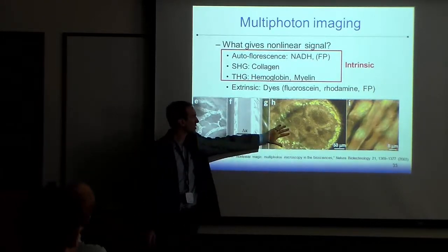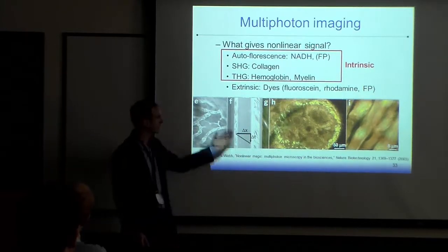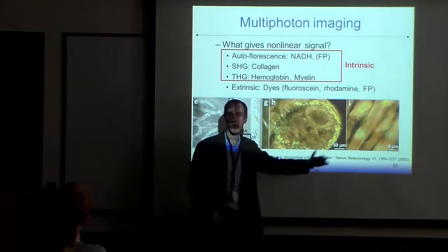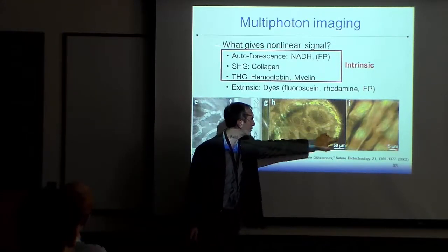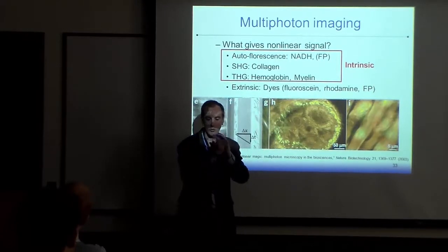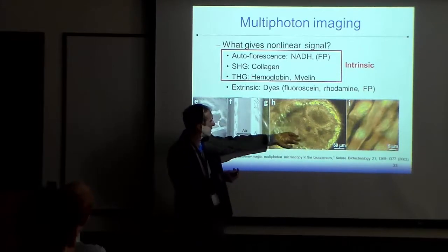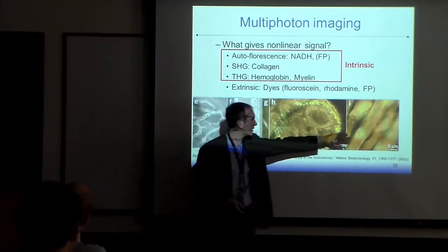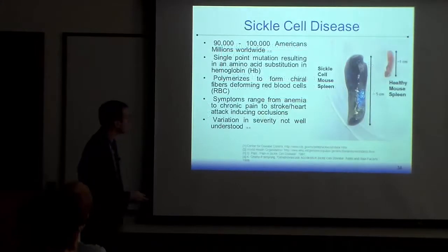We can basically do optical sectioning. This is an intact ovary, and basically we're looking at a slice through here without actually cutting it open. It's hard to see here, but there's a different spectral response on the outside, which is mostly like a collagen, elastin, connective tissue type of capsule around the outside. And then you have the structure of the ovary on the inside. You can see all the cytoplasm of them. And this is a rat tail tendon. You can see nice second harmonic generation signals from it.